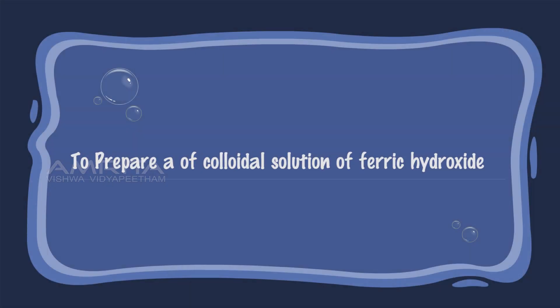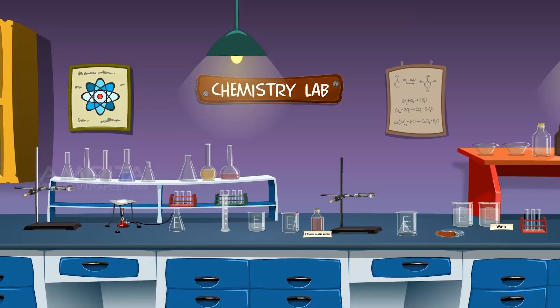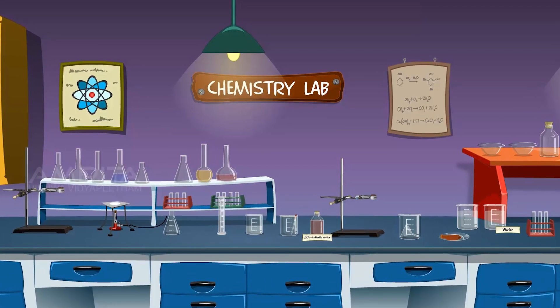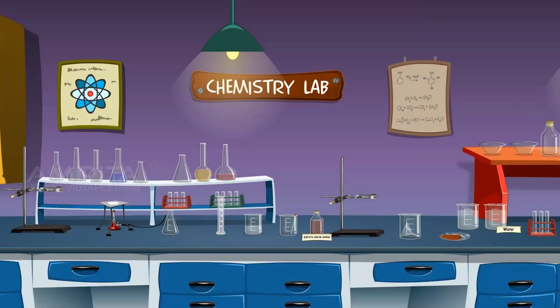To prepare a colloidal solution of ferric hydroxide. Materials required: We require 2% solution of ferric chloride, silver nitrate solution, dropper, glass rod, distilled water, beakers, wire gauze, tripod stand, Bunsen burner, funnel, filter paper, conical flask, parchment membrane, and iron stand with clamp.